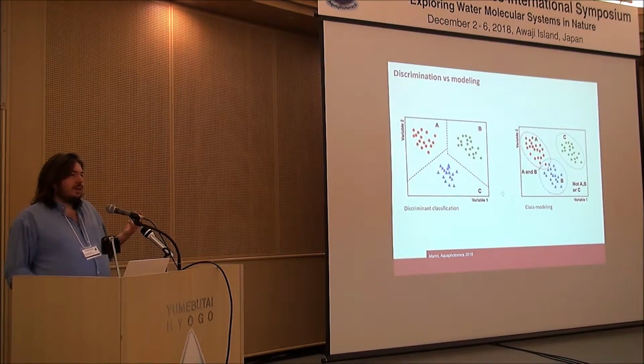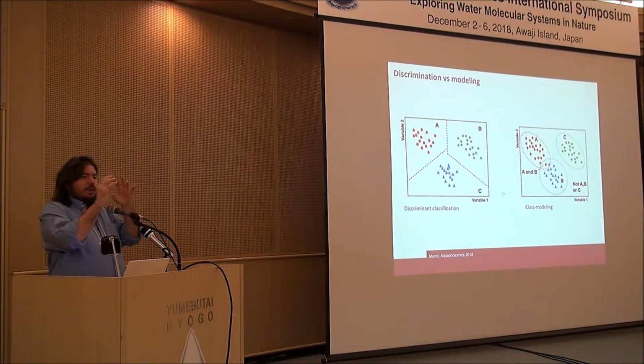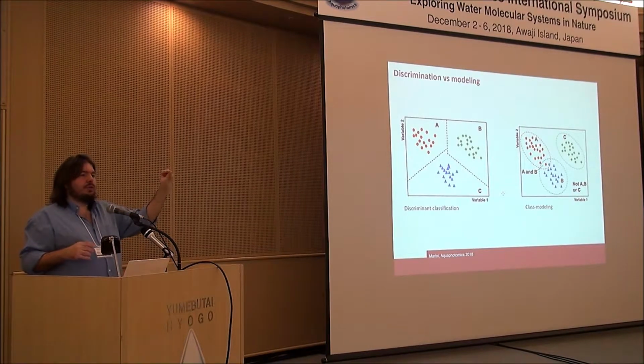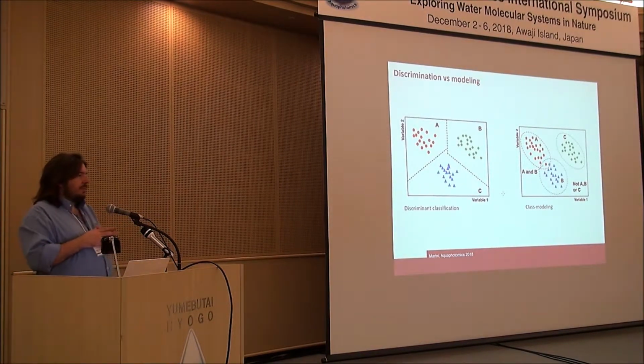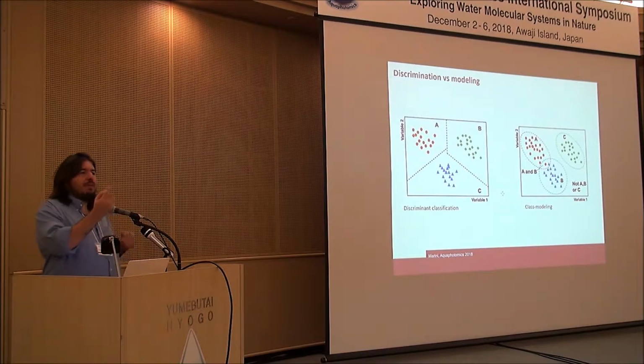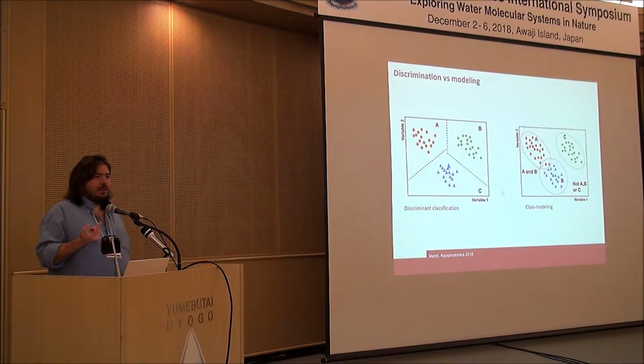And the idea is that I may think of all the objects that constitute a class, so all the objects that represent a particular condition, to be those that give me information on what makes each sample within this class similar to one another.